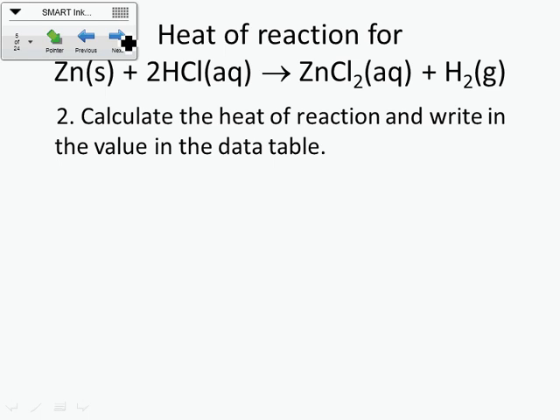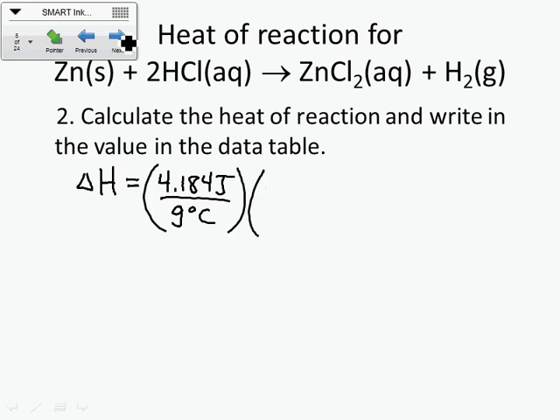All right, well, how are we going to calculate the heat of reaction here? Right, so we're just basically using our formula here, right? So we've got our specific heat, which we decided is 4.184 joules per gram degree Celsius, times our mass, which we just decided was 50 point, did I say 33? Is that right? 33 grams. Times our delta T, which was 3.6, right?